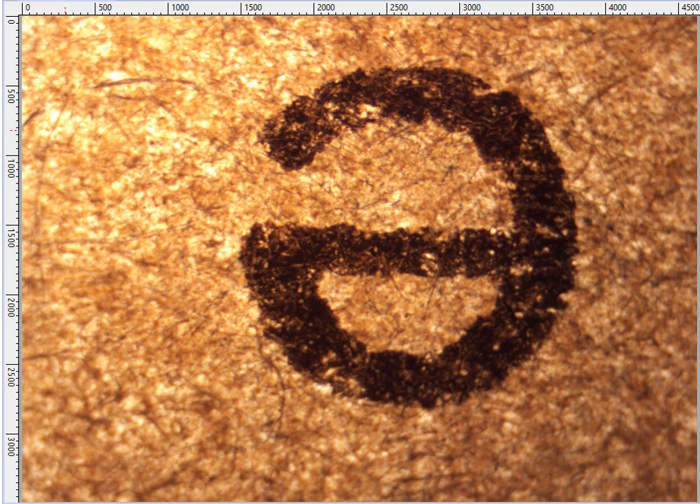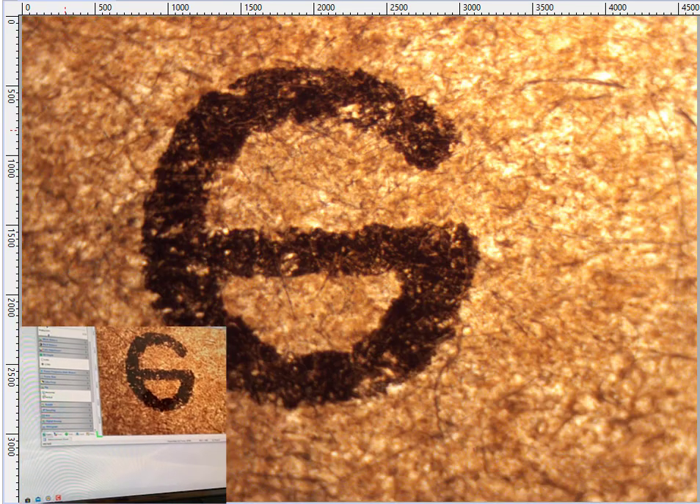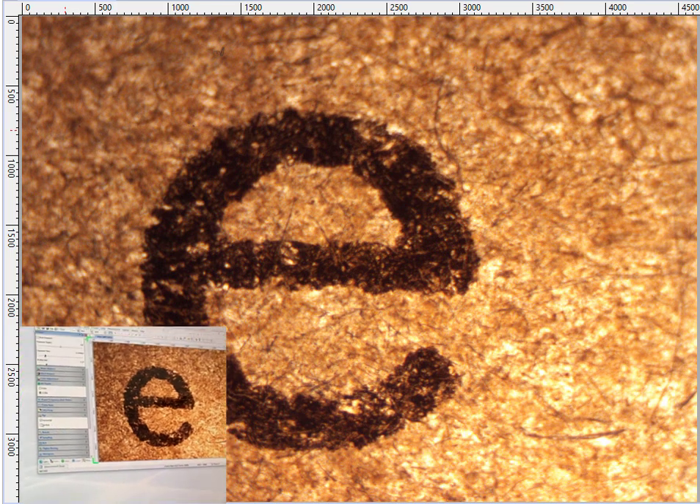But because we have the luxury of having a digital image, we can take that digital image and with a few flips and twists, we can turn the image right side up and facing forward.